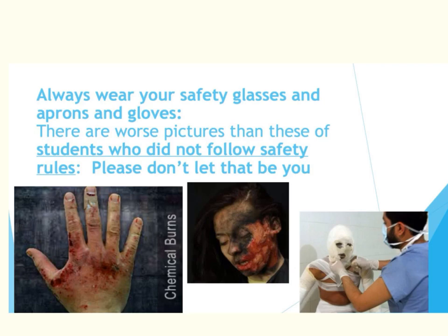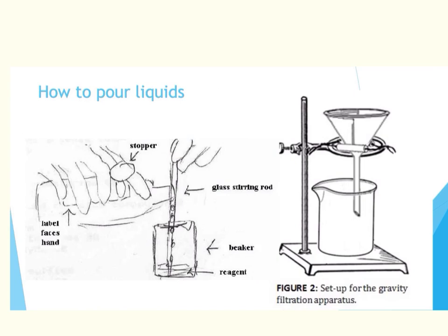There are worse pictures than these we could show you, so let's never let this happen. By spending time reviewing over this material, this is to ensure that none of these issues will ever occur in a lab. After over 20 years of teaching chemistry, the worst issues I've ever had happen were an occasional cut or burn. We've never had any serious issues and I would like to keep that record as it is.